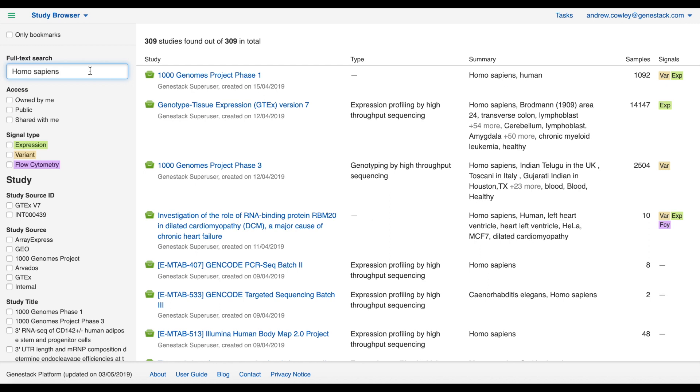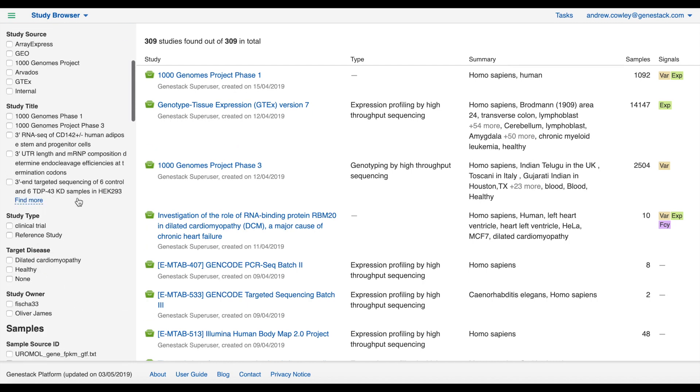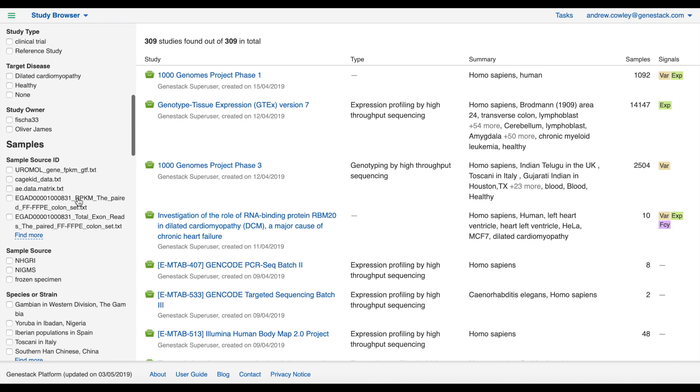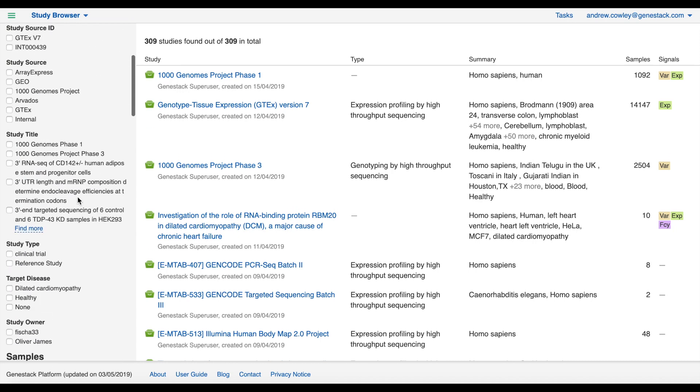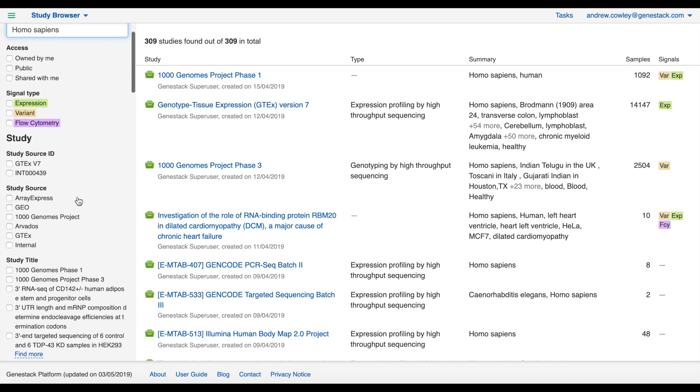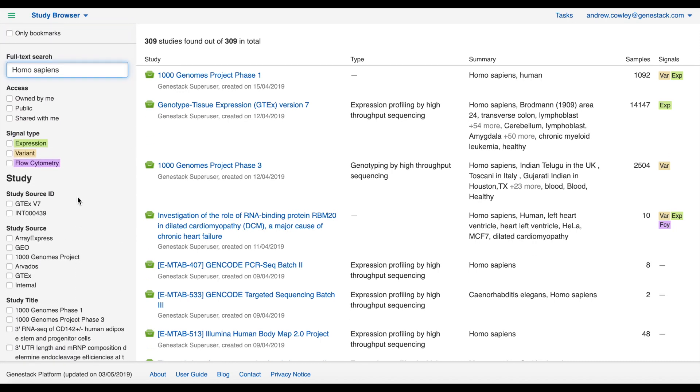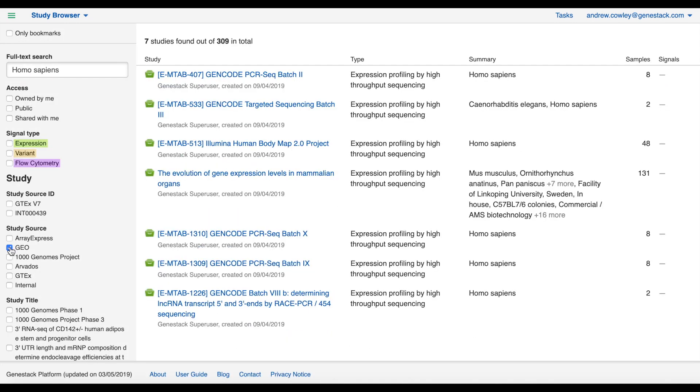Underneath the search box we have filters for study ownership so you can quickly filter down to say public data, and filters for which signal types you wish to be present in your studies. Beneath that we have further facets based on the metadata values that are present in ODM, grouped into study, samples, and then the individual signal types. For example, I could click GEO to show all studies that came, unsurprisingly, from the GEO repository.